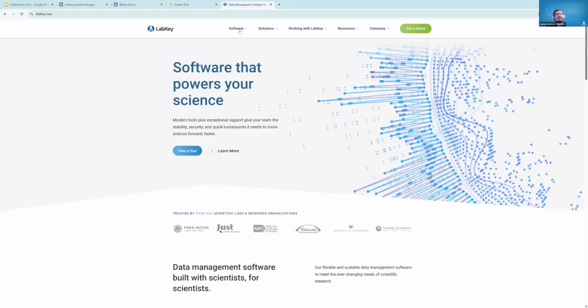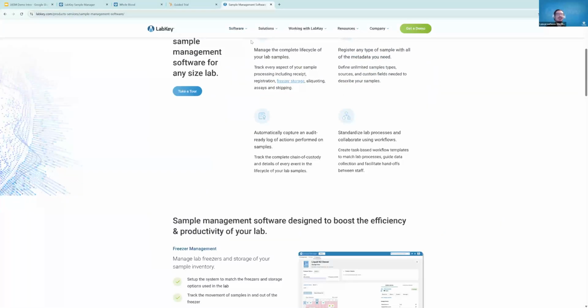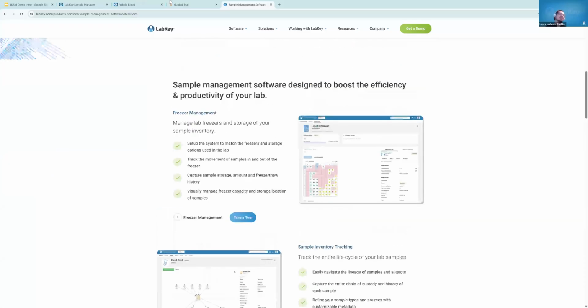And then, of course, if you want more information, we have more items on our website, including pricing. We're very transparent. We believe we should have our pricing on here so you know exactly what to expect. We try not to hide anything because we really value our partnerships and want to be upfront with you as soon as possible. So I will go ahead and go into the questions that we have today.